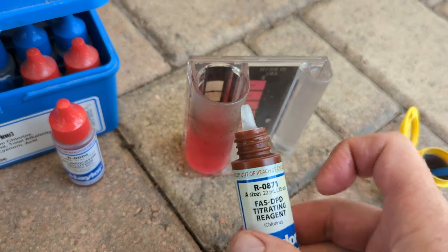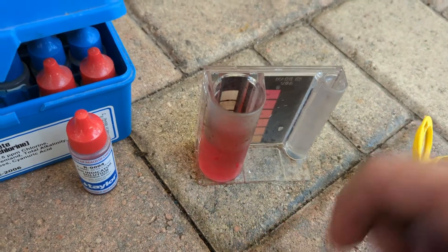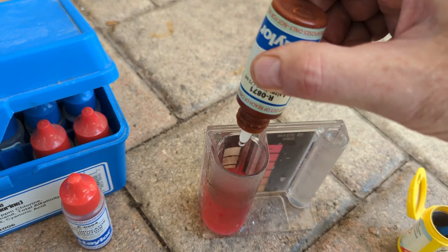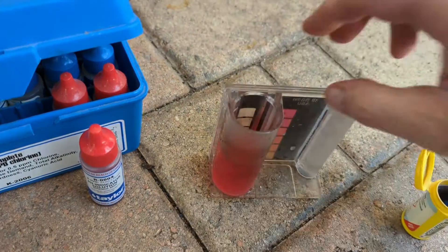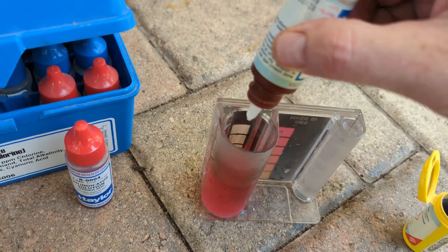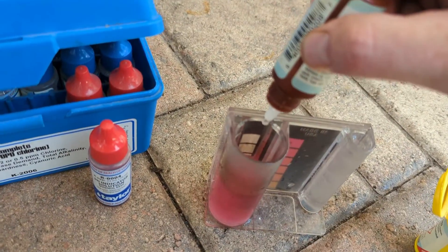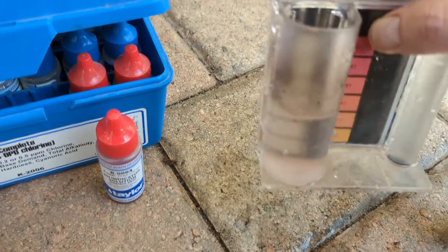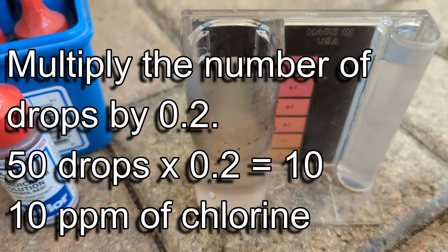This is our R0871. What we're going to do is put drops in until it turns clear, and we're going to count the drops. Excuse me, doing this with one hand. We counted out 50 drops total before it went clear. So we multiply that times 0.2, and that gives us a chlorine reading of 10.